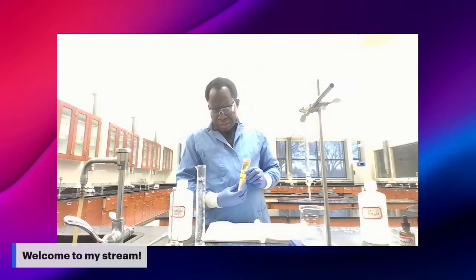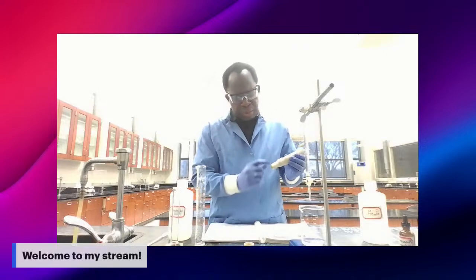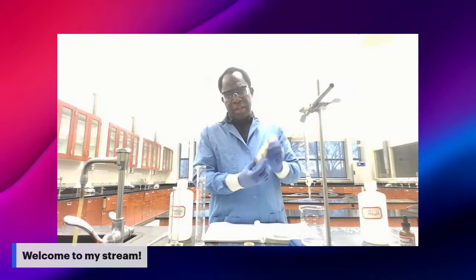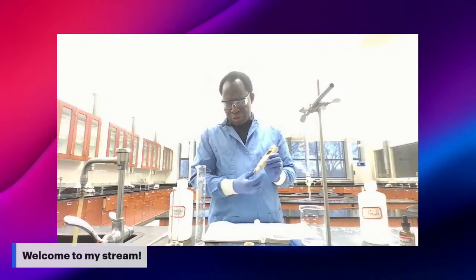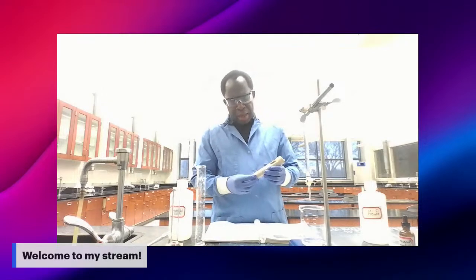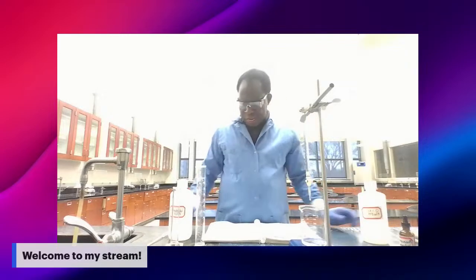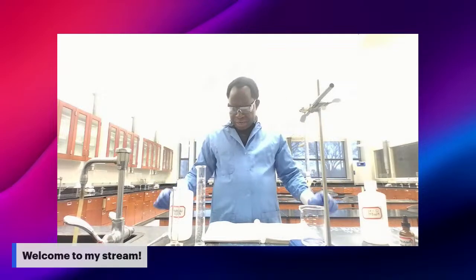When you're done, you make sure your pH meter probe is clean and ready to perform the lab. So I have my pH meter on the side. It is ready for the lab.